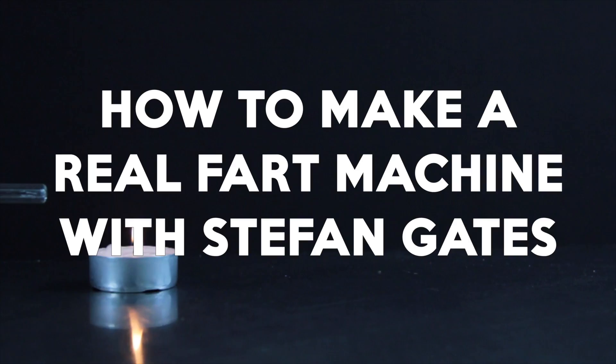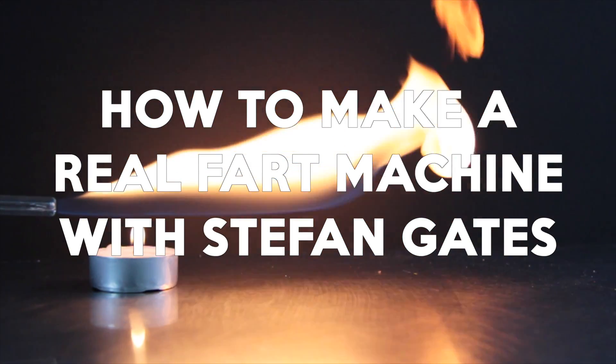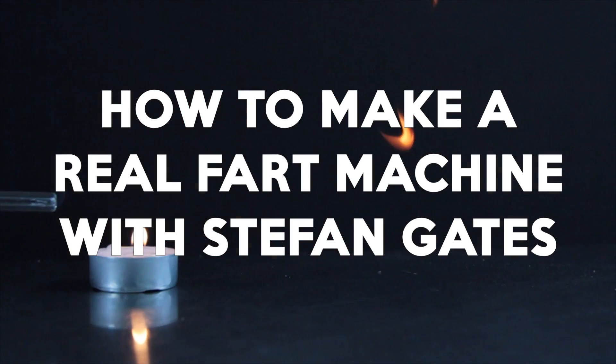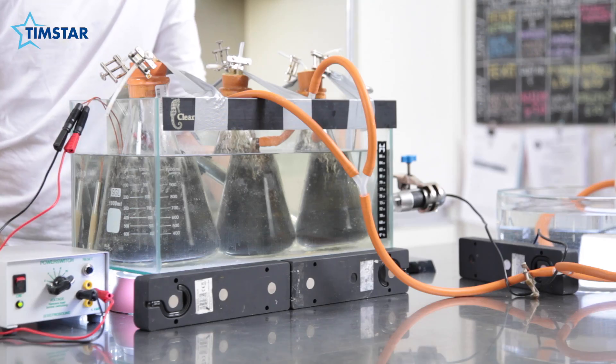It's time to pack your hang-ups away because I'm going to show you how to make a fart machine. I'd like to introduce you to Freddy. Freddy is a fart machine. If you're kind of highfalutin and want to be intellectual about it, you could say Freddy is an anaerobic digester. But Freddy really is a fart machine — he recreates what happens in your colon, the last bit of your digestive system before you take a poo.